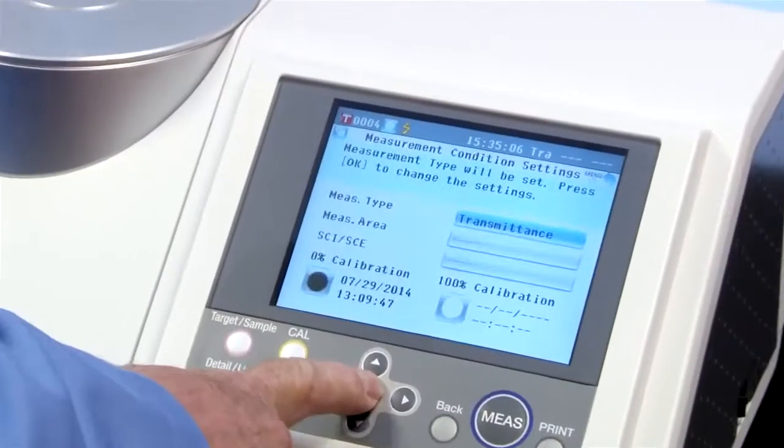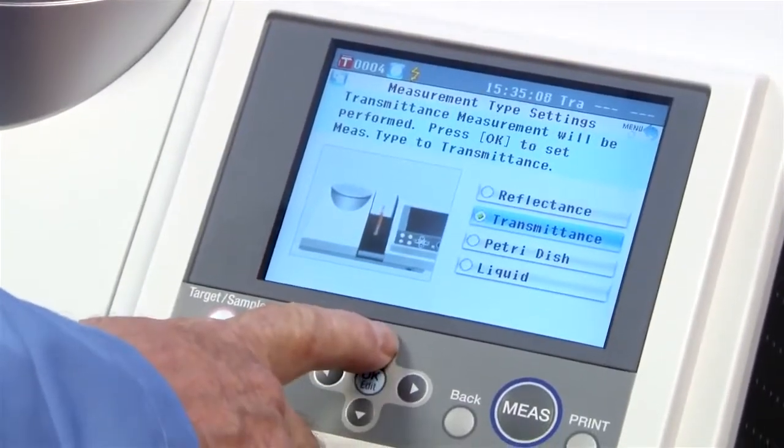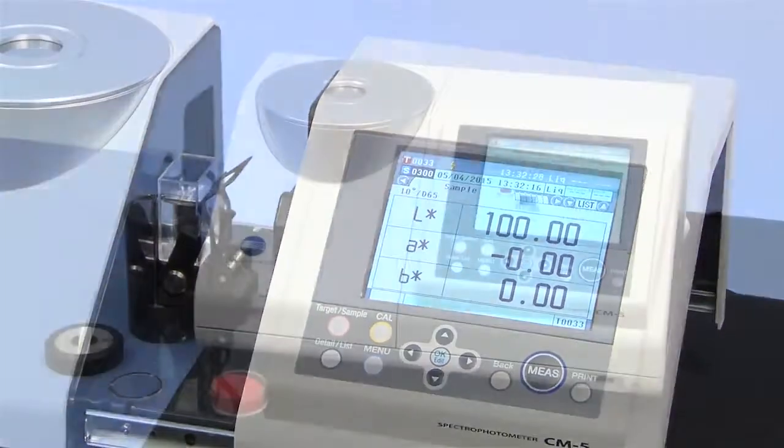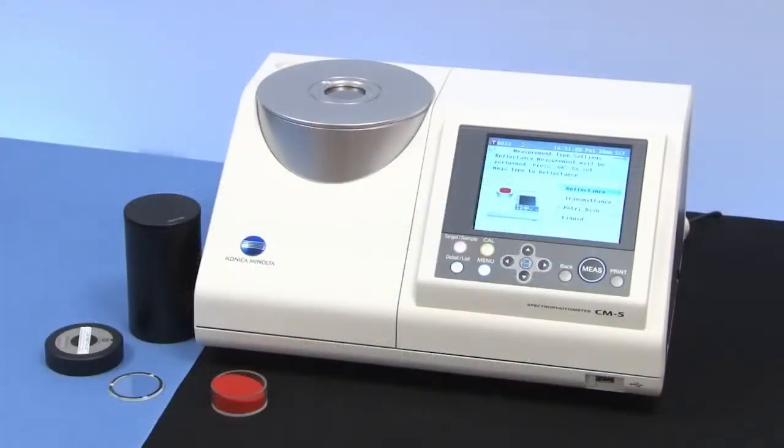Quickly switch various modes in reflectance or transmittance including petri dish and liquid. Configure the CM5 to your measurement requirements.